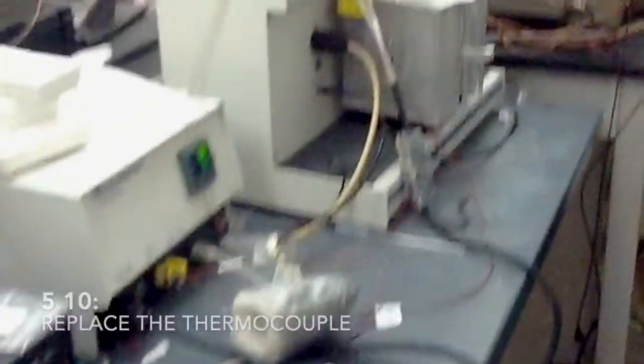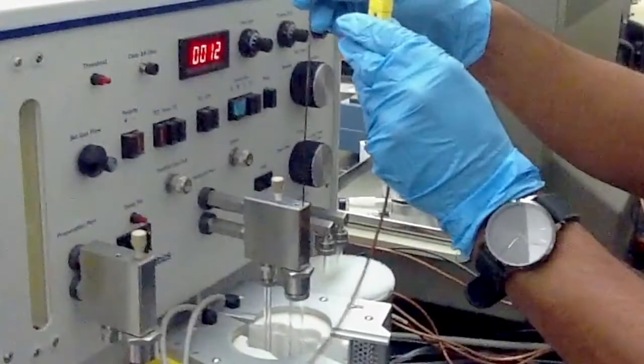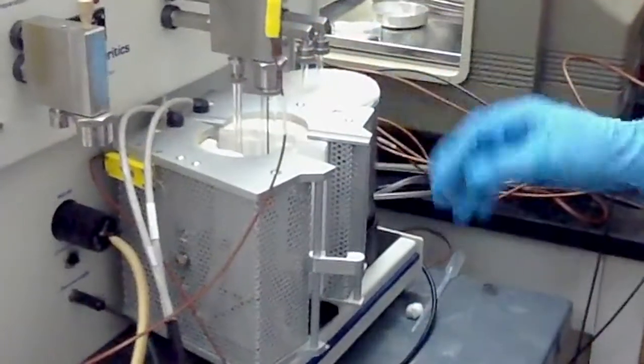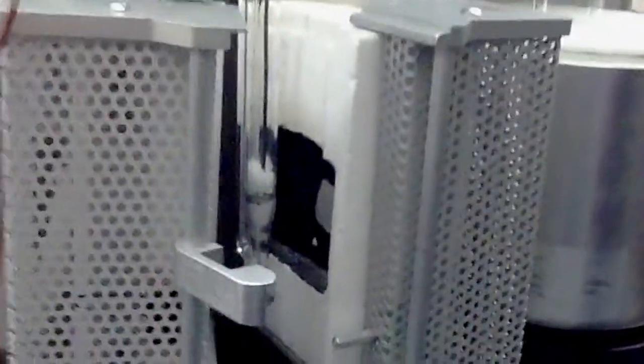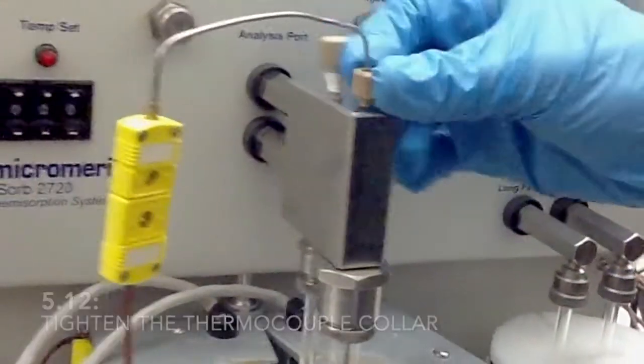The thermocouple, which we took out first, goes on top, and as I previously said, you have to be careful, this thermocouple goes just above your sample. So we'll pull it down all the way to your sample here and tighten this part using your finger.